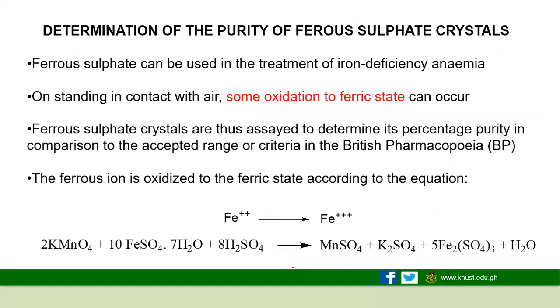Good. Now, determination of purity of ferrous sulfate crystal. Ferrous sulfate can be used in treatment of iron deficiency anemia.